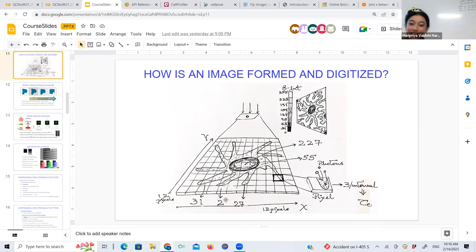The other thing you cannot count is half a pixel. Each pixel is one unit. It's integrating over that entire sensor. So if somebody tells you, I've got nanometer resolution because I can tell you what is going on in a quarter pixel, rubbish. You don't want to believe that. So these lower limits on what is the minimum distance or intensity that you can measure, that's called the resolution of your image.